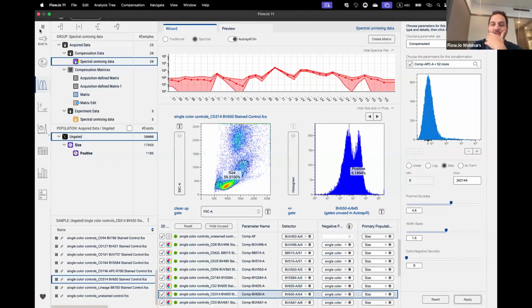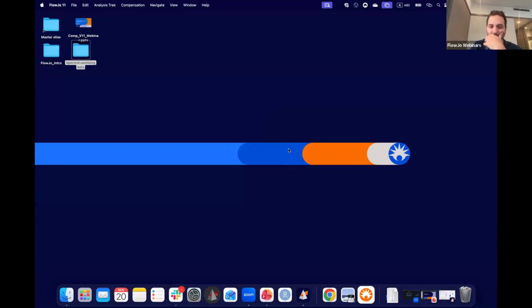Okay, so that was it. I went a bit over time just to show you the software, but that was really it. I don't know if you have any other questions. I will look, I have something in the Q&A box. Somebody else asked about weight optimization. We don't have that integrated yet in version 11, but I'll make sure to transfer this feedback and I'm happy to have it there for you.